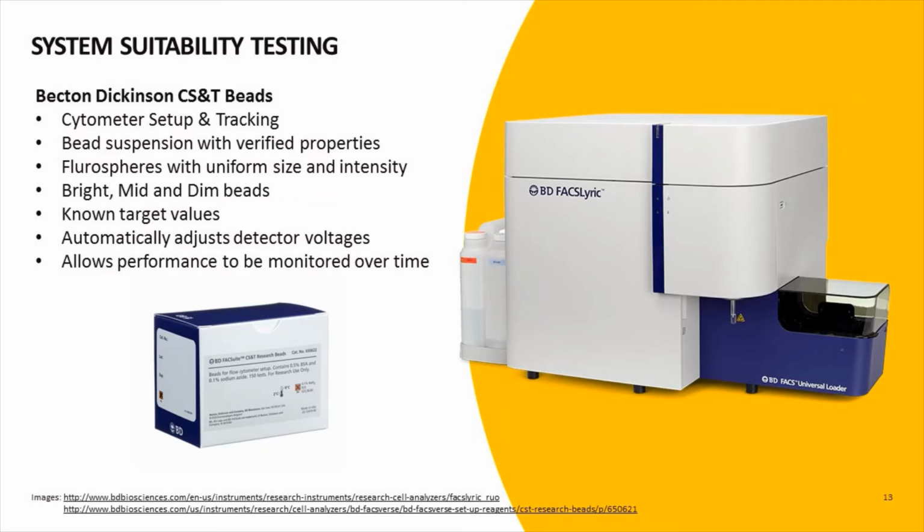To ensure optimum consistent performance of our instrument, the FACSLyric, we use BD's CS&T beads. These beads are fluorospheres with a verified size and fluorescent intensity. When these are run on the instrument, the system automatically adjusts detector voltages based on the expected values. It also allows instrument performance to be monitored over time. If there are any anomalous results, the system automatically alerts the user.